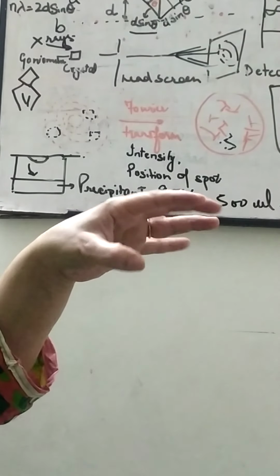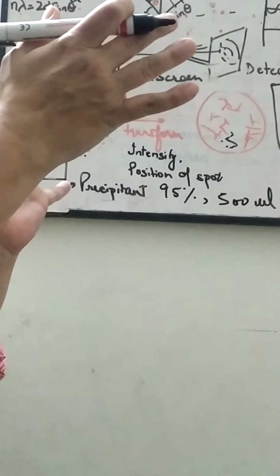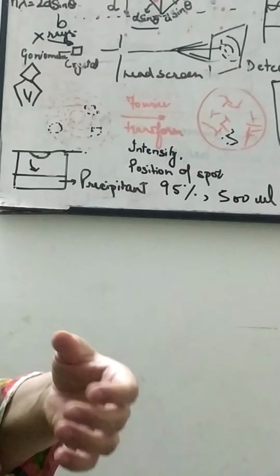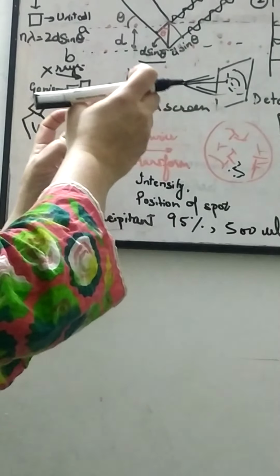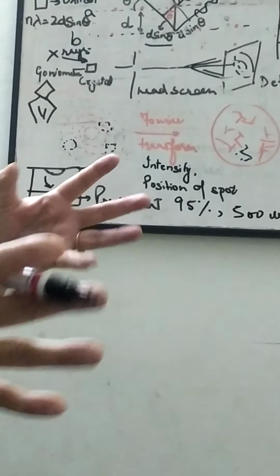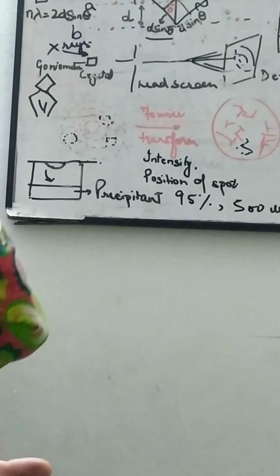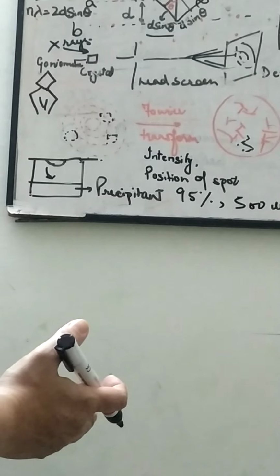Now indexing needs to be done. What is indexing is that now we have got an electron density map and we know the real structure of the macromolecules. It is made up of carbon, hydrogen, oxygen, nitrogen. Then physically we start fitting in the structure of those, overlapping the structure of carbon, hydrogen, what kinds of bonds are possible, and then we detect the actual structure of the compound. So this is all about X-ray crystallography.